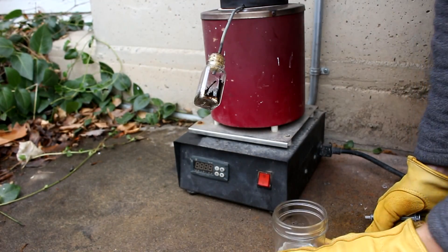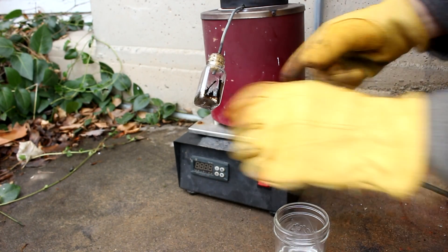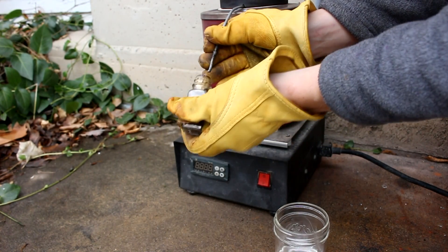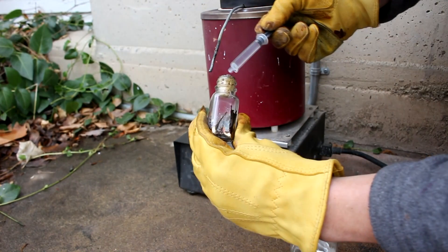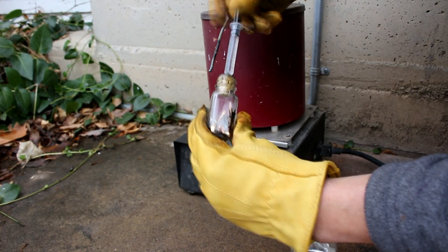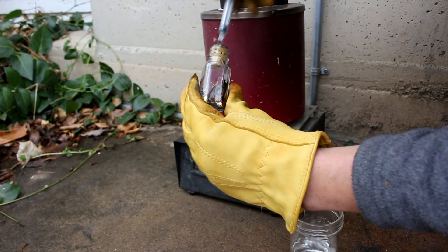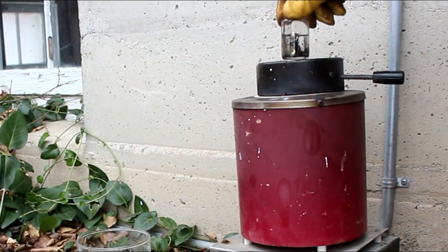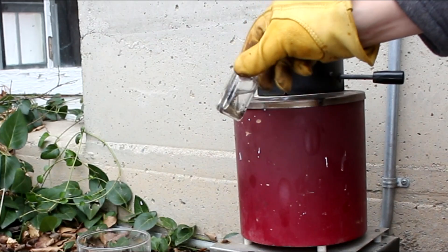So it looks like most of the cesium is finished distilling over. Now what I'm going to do, I'm going to pull this off before too much air can get in there. I'm going to inject some mineral oil into the bottle just to protect the cesium so it doesn't react with the air too vigorously. I've just set the bottle on top of the furnace here to warm it up a little bit.